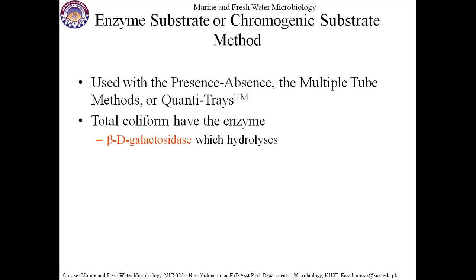Total coliform have an enzyme, and we must be clear on this. The name of that enzyme is beta-D-galactosidase.